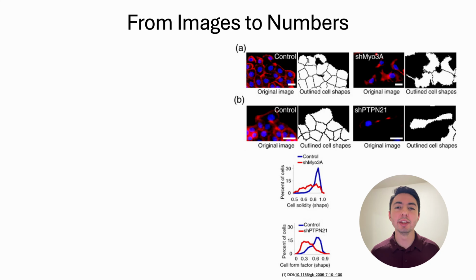Hello, my name is Rodrigo, and in this video I'll be talking about high content screening data. We'll start with talking about how we go from images to numbers.